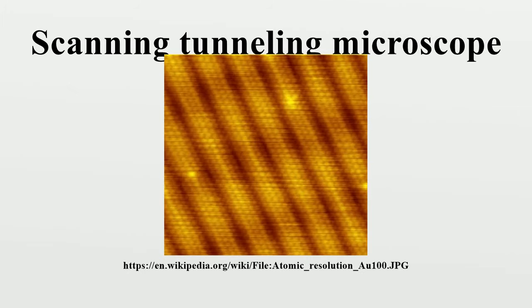In constant height mode, the voltage and height are both held constant while the current changes to keep the voltage from changing. This leads to an image made of current changes over the surface, which can be related to charge density. The benefit to using a constant height mode is that it is faster, as the piezoelectric movements require more time to register the height change in constant current mode than the current change in constant height mode. All images produced by STM are grayscale, with color optionally added in post-processing in order to visually emphasize important features.